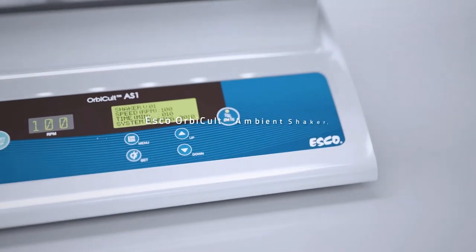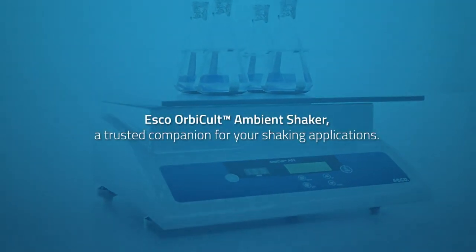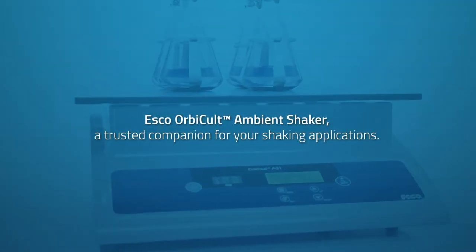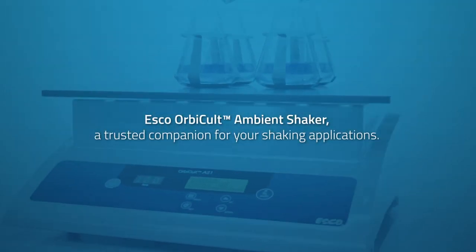Esco OrbiCult Ambient Shaker, a trusted companion for your shaking applications.